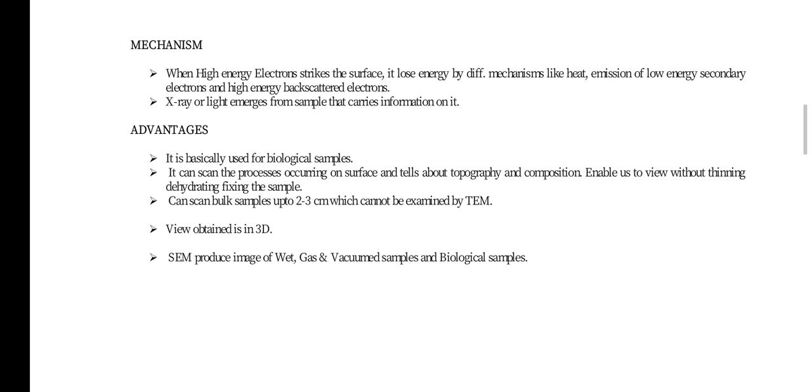The view obtained is in 3D, and the scanning electron microscope produces images of wet, gas and vacuum samples and biological samples.